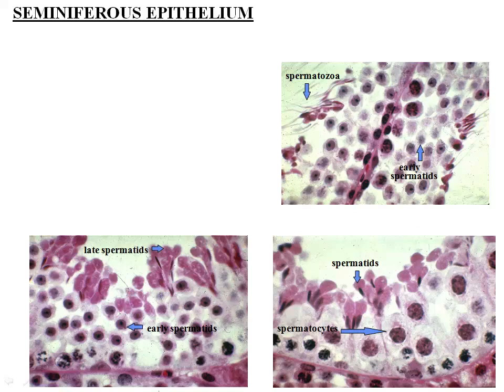Now in this photograph you can clearly see the early spermatid development. Chromosomal structures are visible and you can see different dividing stages, meiotic stages, in these seminiferous tubule cross sections. They go on developing and form a late spermatid, and the mature spermatid remains attached to this stalk-like portion, which is the Sertoli cell.